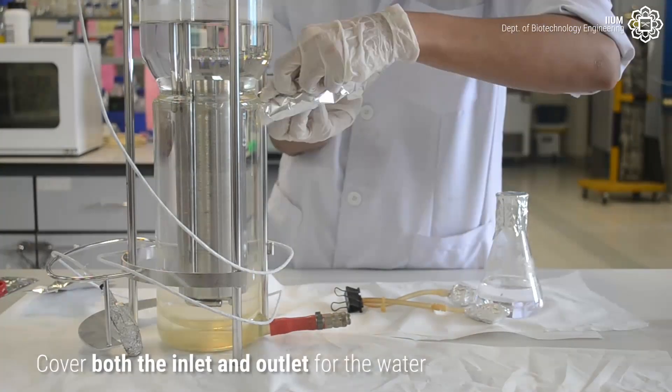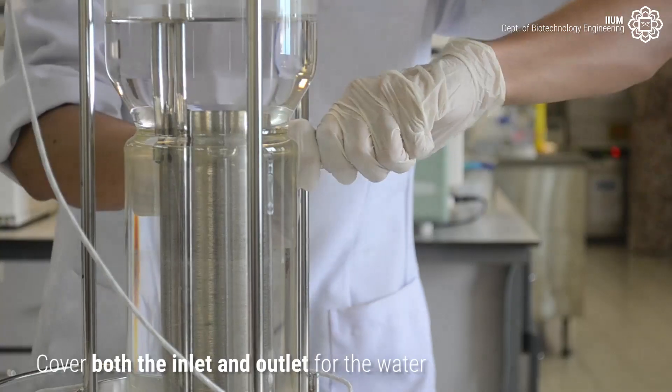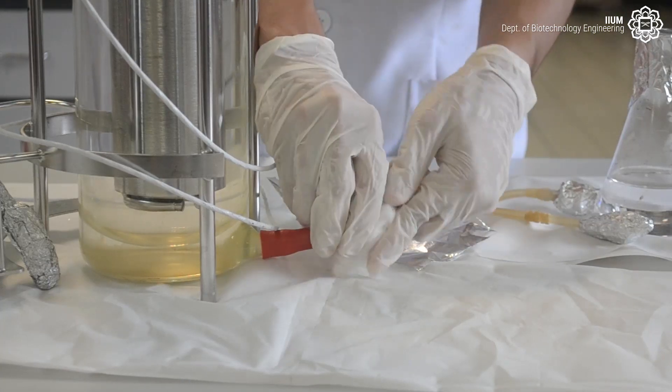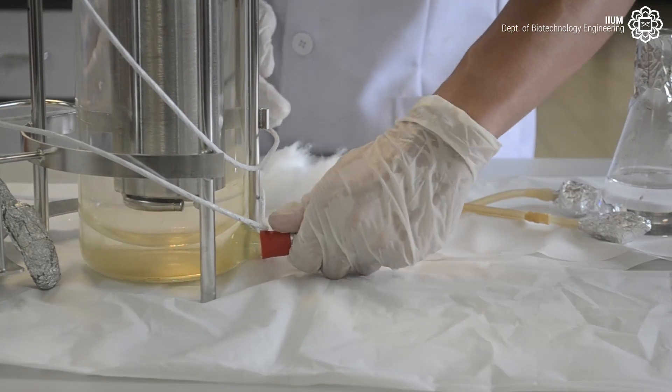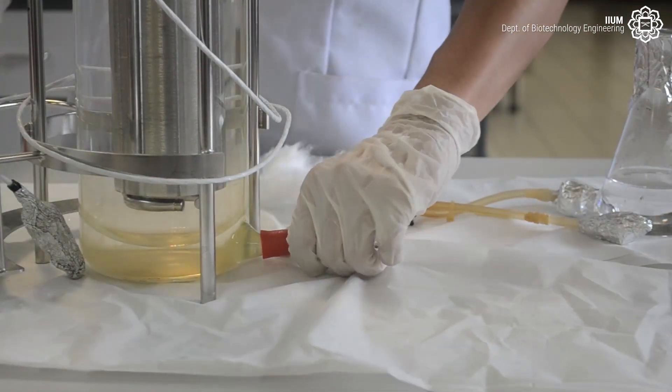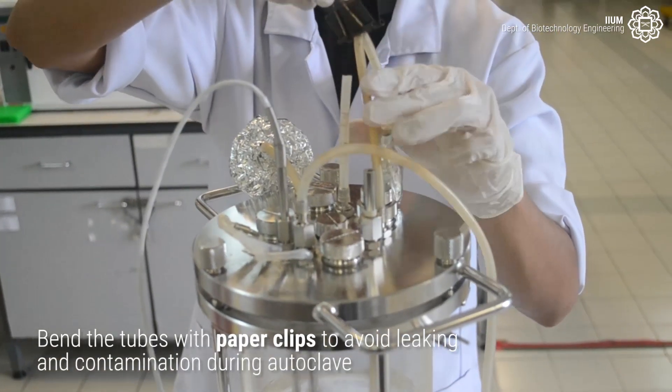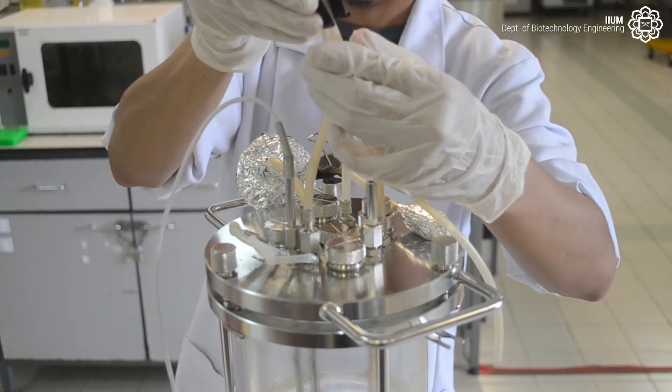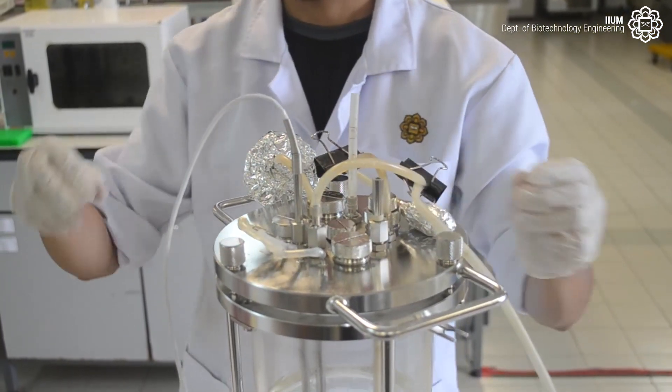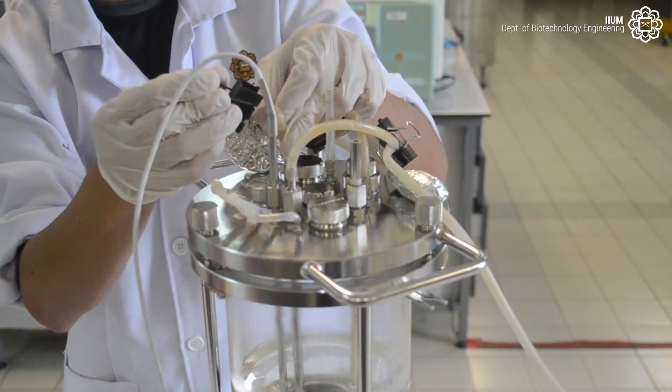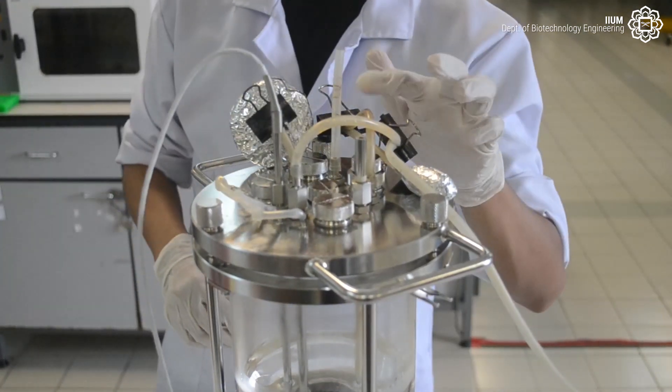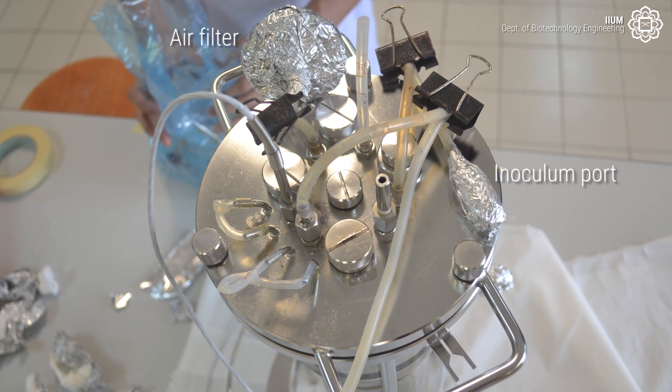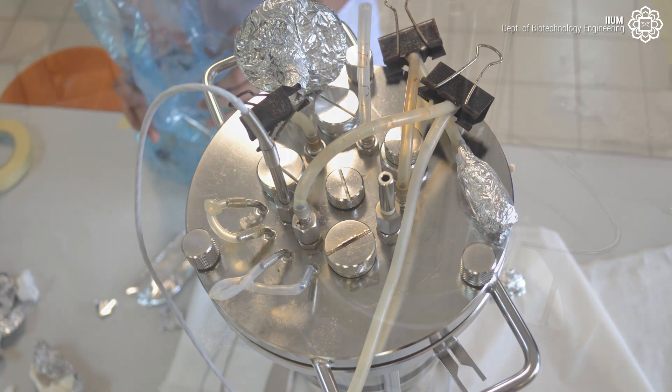Next, cover both the inlet and outlet of the water. After that, bend the tubes with paper clips to avoid leaking and contamination during autoclave.